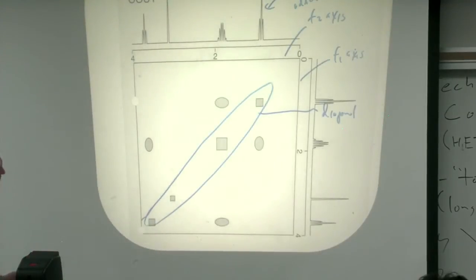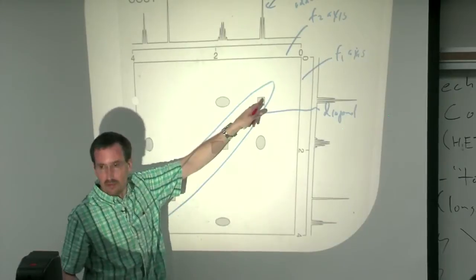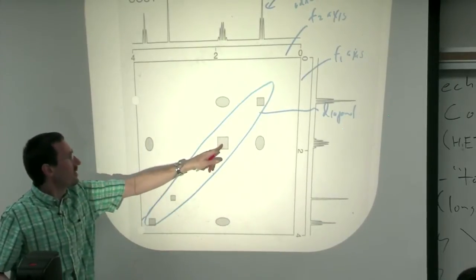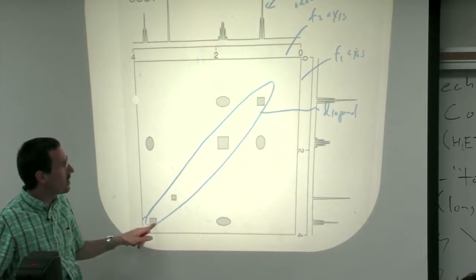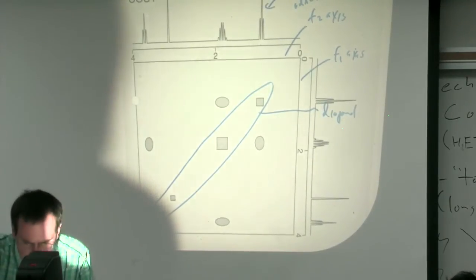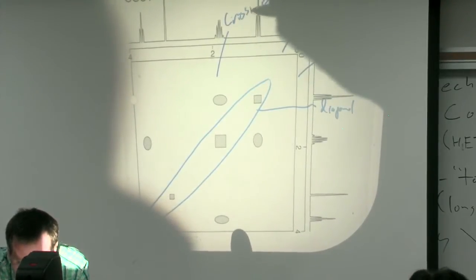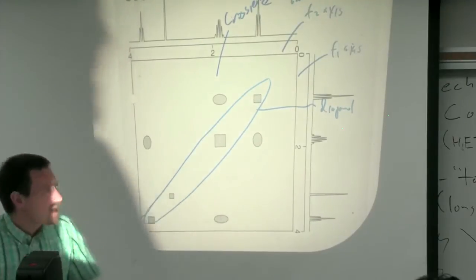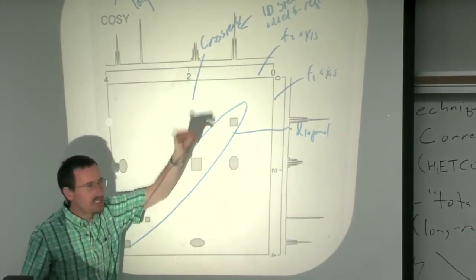And the diagonal basically is just the spectrum. In other words, it's the methyl peak here, the methylene here, the OH here, and the methylene next to the oxygen. These are the peaks that are interesting. These are called the cross peaks. There are 4 of them here. The cross peaks, if you'll notice, are symmetrical about the axis.